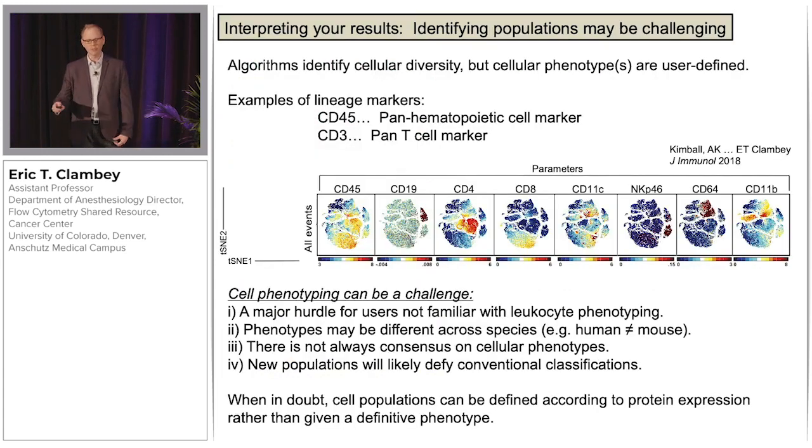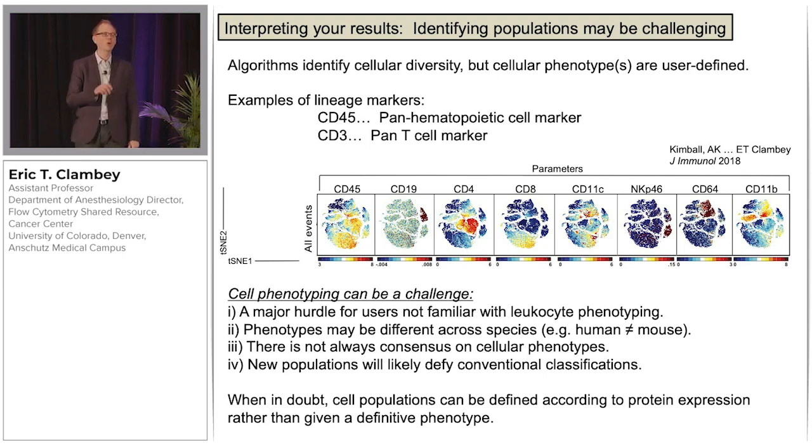The last challenge that I would identify is that of identifying cell populations. For those of us who are comfortable doing immunophenotyping, this may seem like a no-brainer. This is easy. Why are you talking about this? But there are many people who want to get into CyTOF analysis who are not comfortable or not well-versed in the complexities of immunophenotyping. And so this presents a significant hurdle to new users.